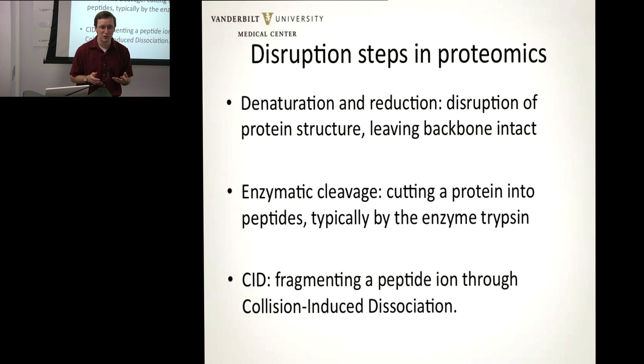Next, they've got all these nice disulfides. Now, I think of these as sort of safety pins holding these structures in place. So if we can break the disulfide bonds, if we can reduce them and alkylate them to prevent them from reforming, then that's going to be very helpful to us. So this takes the three-dimensional structure of the protein and reduces it to something more like a long line of amino acids in solution. That's a whole lot more tractable for analysis.